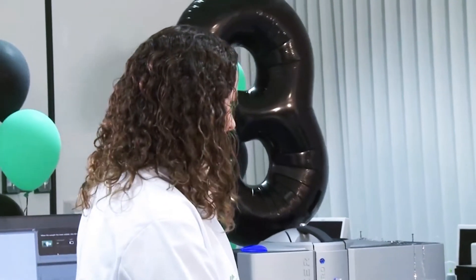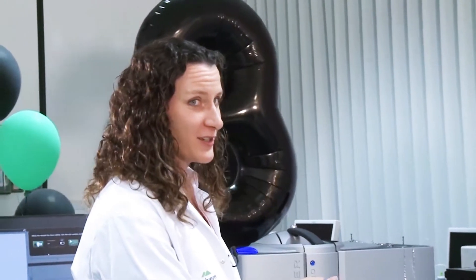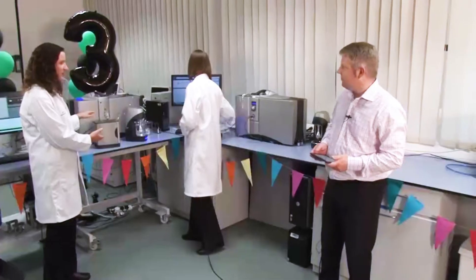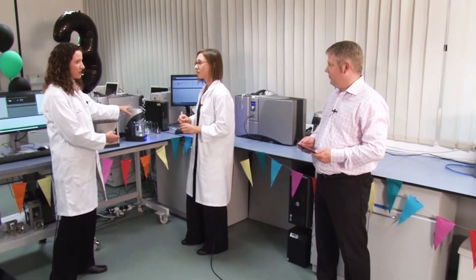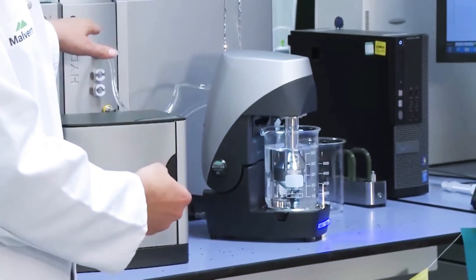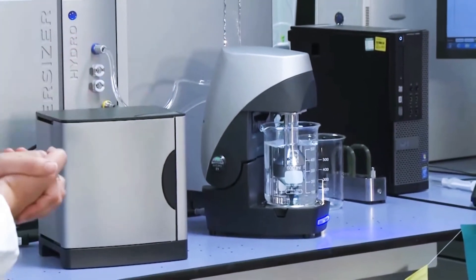Well, I'm really pleased to be here to introduce our HydraSight to you. So this is an imaging device that can be placed in line between your liquid dispersion unit and the laser diffraction cell so that we'll be able to see what's going on.